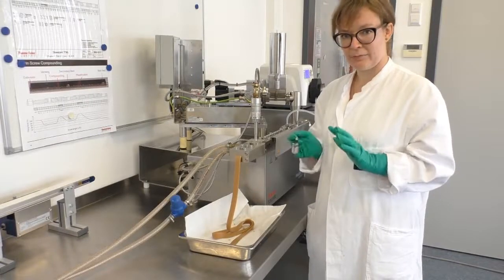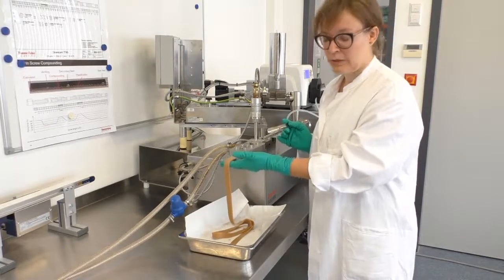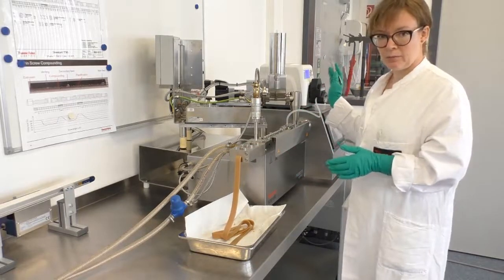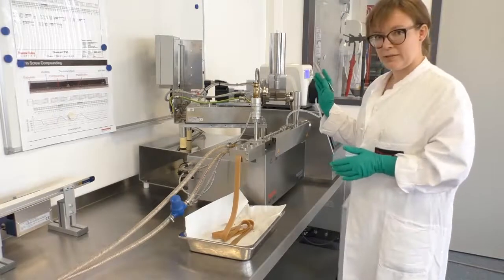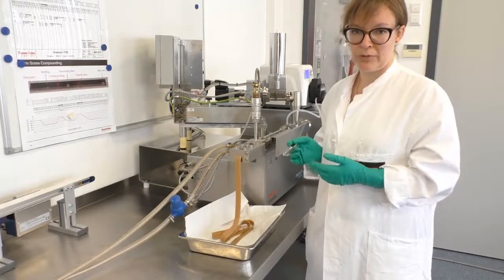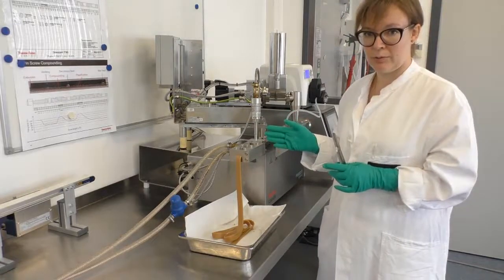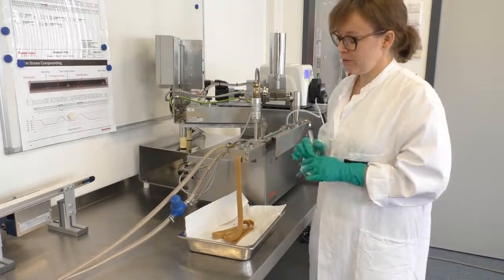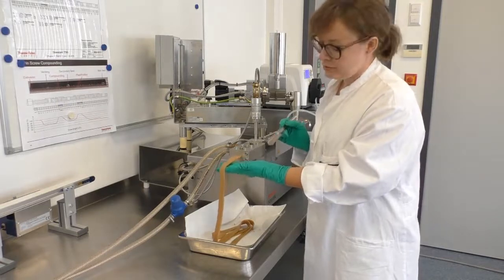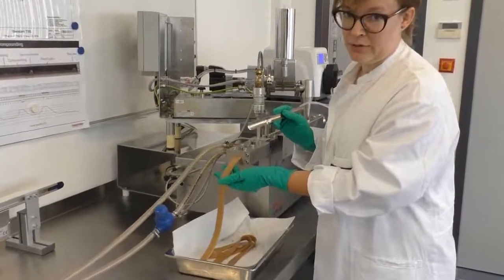After about 5 to 10 minutes, we have reached stable conditions with the extruder, and you can see that the product is coming out of the extruder. Right now, the extruder is operating at 780 milliliter water per hour and 520 gram of powder per hour. So we have a total throughput of 1.3 kilogram per hour. At this point, before the material enters the die, it has a material temperature of about 130 degrees Celsius. We see here that the product is flowing out of the extruder. It looks quite smooth and slippery, which is due to the high water content.